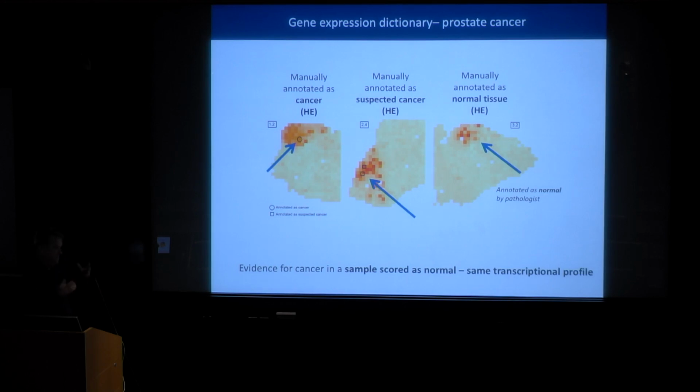The second one, he suspected this was cancer. We could confirm that, and we could also find areas that have a cancer profile that was not picked up. So we see that machine learning will have an impact also with this type of study.